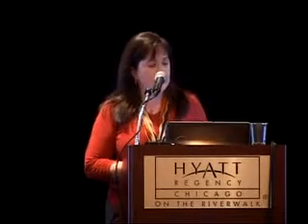And that's going to be your estimated number of concurrent users for the system. You need to figure out how you're going to host the hardware for your system. Is it going to be hosted locally with local IT support? Are you going to host it locally with remote IT support? Are you going to host it remotely with remote IT support? Those all play a big impact as to what needs to be included in your contract.